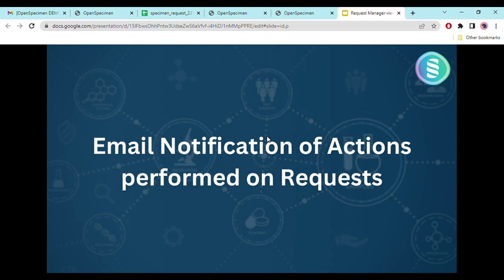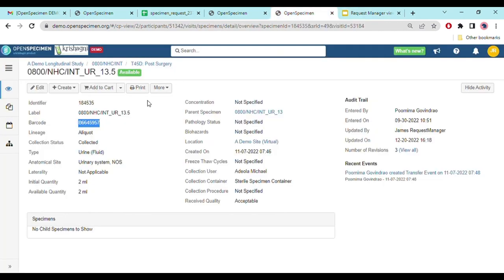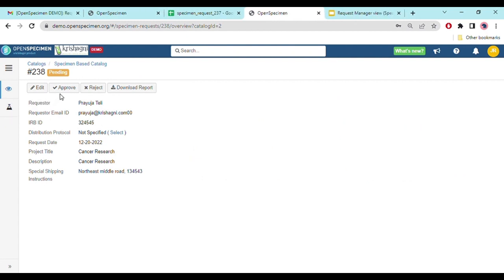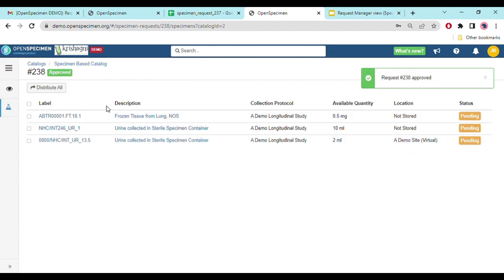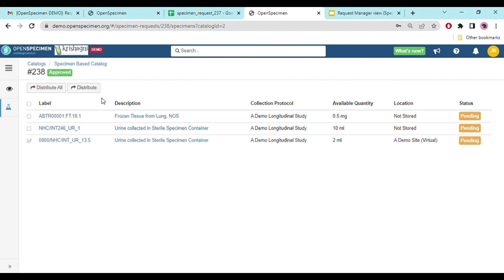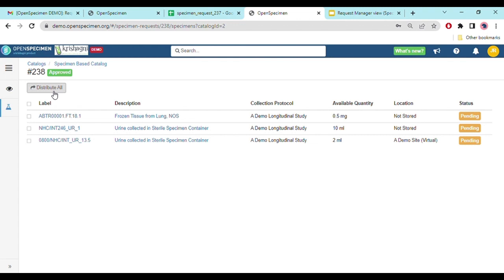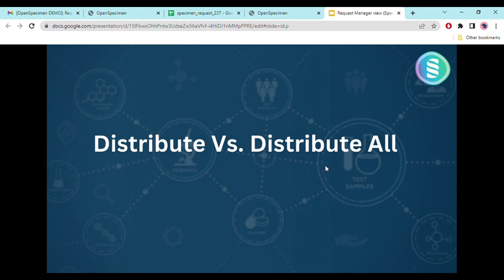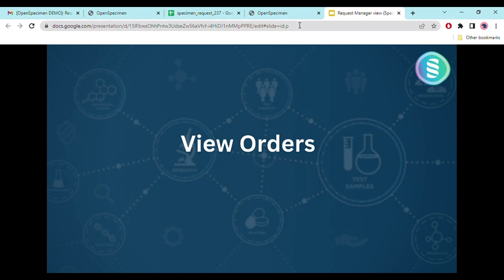We saw email notifications for actions performed on a request. Now let's look at 'Distribute' versus 'Distribute All'. Once a request is approved and you go to the specimens tab, you see the 'Distribute All' option. If you select a specific sample, the 'Distribute' button becomes enabled. The difference is: if you want to distribute a specific sample, select it and use 'Distribute'; if you want to distribute all samples without selecting them one by one, use 'Distribute All'. Clicking 'Distribute All' redirects you to the orders page where you select the institute and site for distribution.